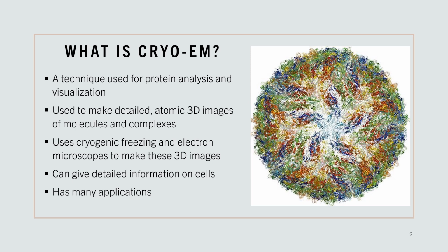Cryo-EM has been used in microbiology, immunology, neurobiology, and many more. It has been used to look at viral infections and bacteria, to visualize protein aggregations and neurodegenerative disorders, to study multicellular organisms, and more.